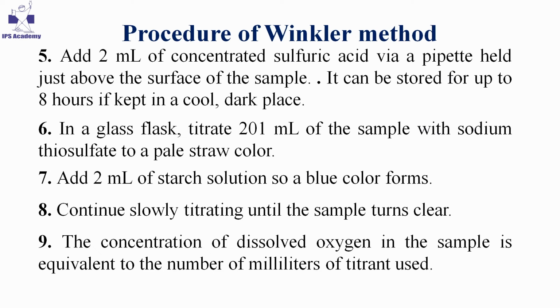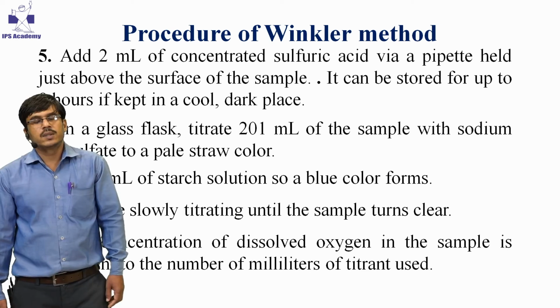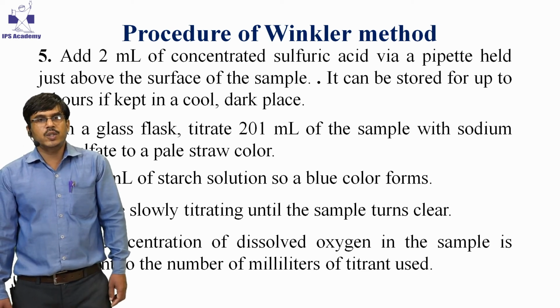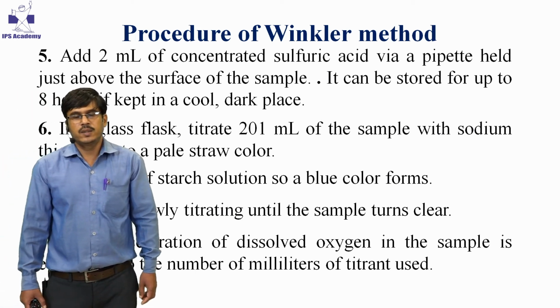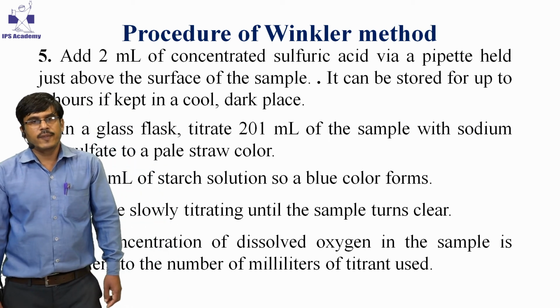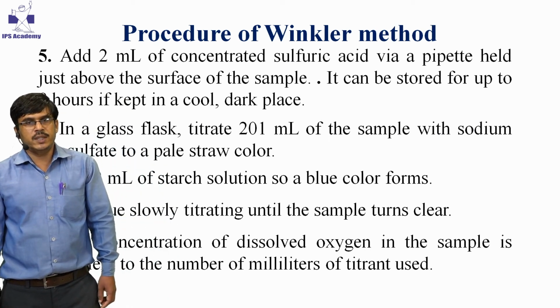It results in blue color due to the formation of starch iodide complex. Continue adding hypo solution till the blue violet color discharges. The discharge of blue color is an indication that the end point is reached.